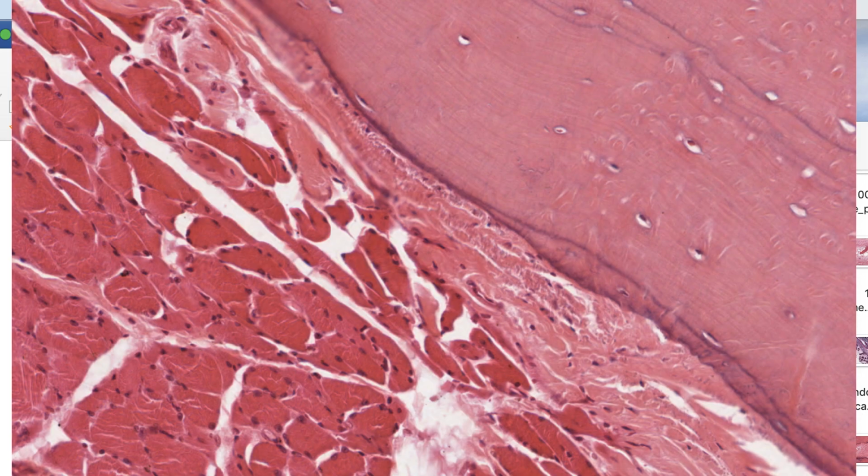The inner osteogenic layer is composed of a single layer of osteoblasts, with a scattering of indistinguishable osteoprogenitor cells external to them. These osteoblasts are really just visible by their very flat nuclei on the surface of the bone, underneath the coarse collagen bundles of the fibrous layer.